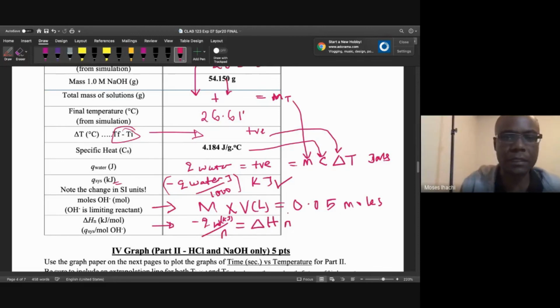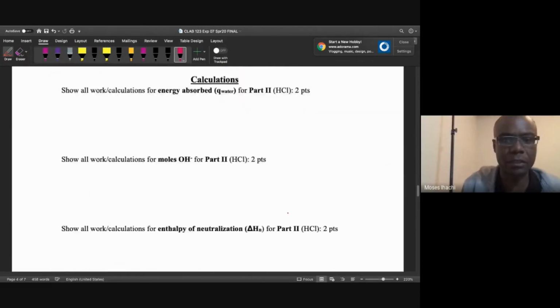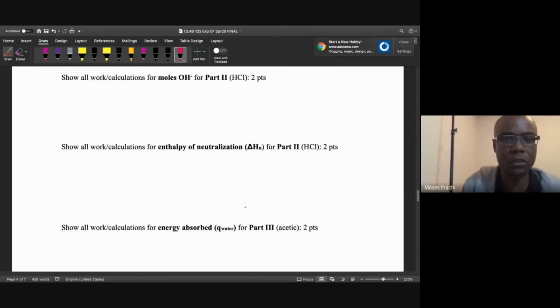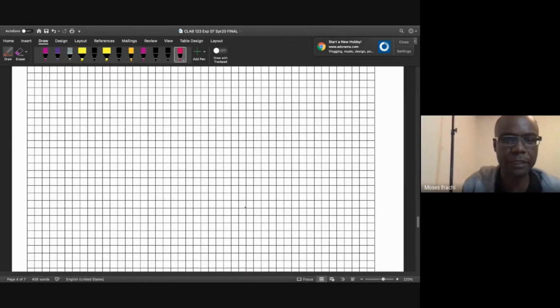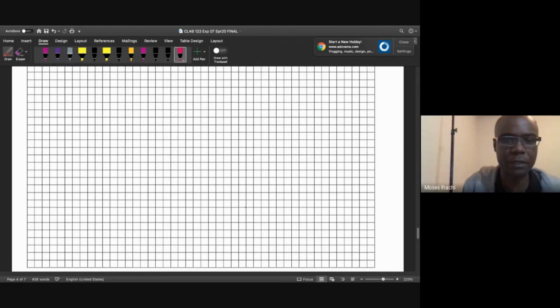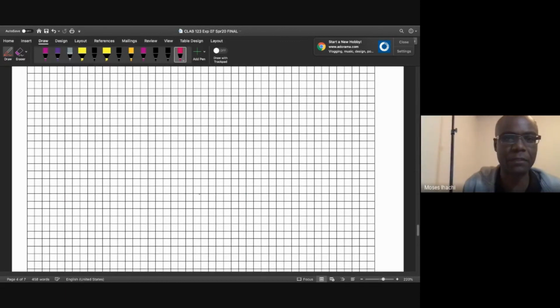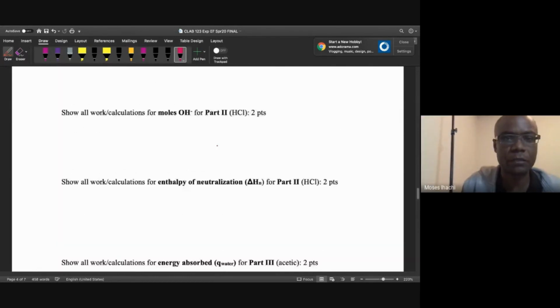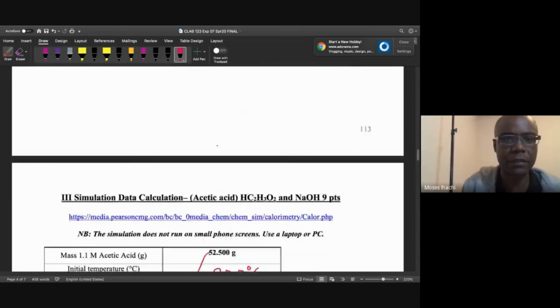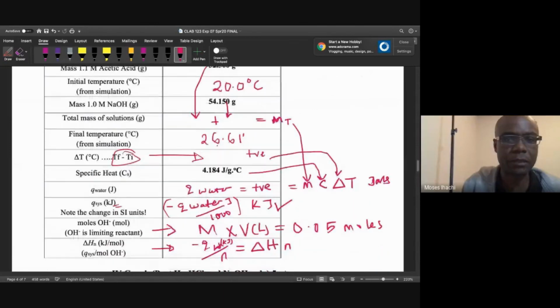All right, so that ends my explanation, and you need to show your work calculations, watch your significant figures, and that's your graph. You need to draw it manually. Make sure your graph covers much of this space. All right, there are two more questions at the end you need to answer. Do you have a question before I end the lecture?